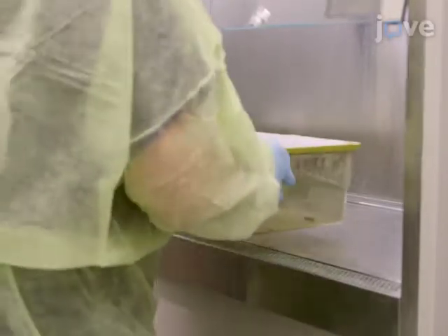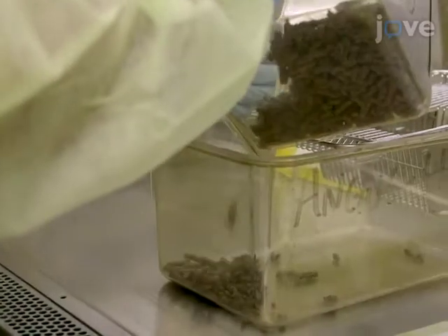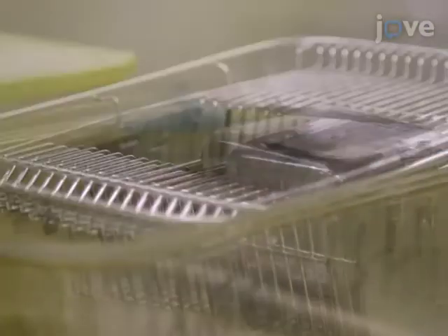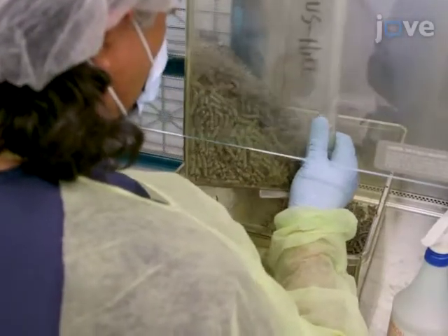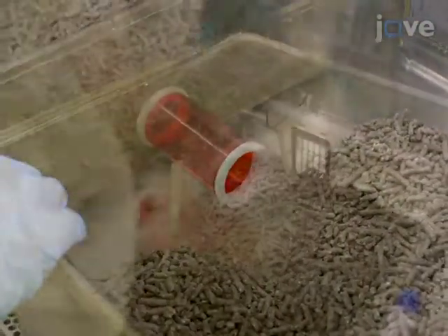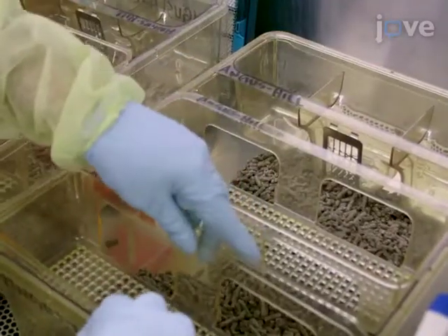Set up the cages under sterile conditions working under a ventilated hood. The controls for this experiment consist of conventional cages with bedding and lab tissue for nesting, but otherwise lack enrichment devices. To set up the pup rearing or environmentally enriched cages, connect two large autoclaved cages with a sterilized grommet-secured tunnel, and include a sterilized platform in each cage to increase floor space.